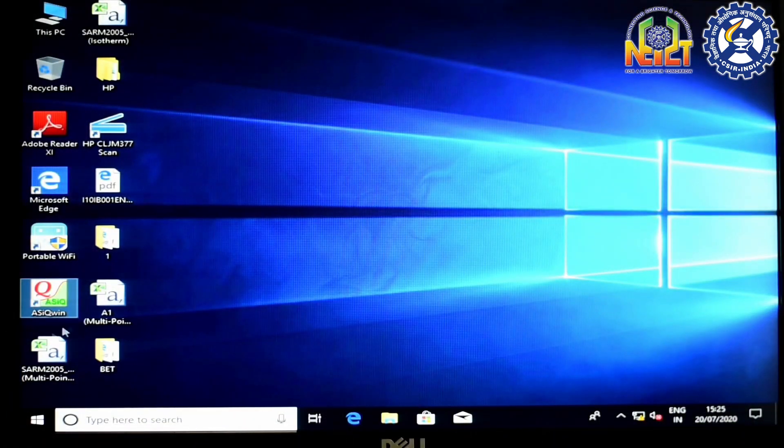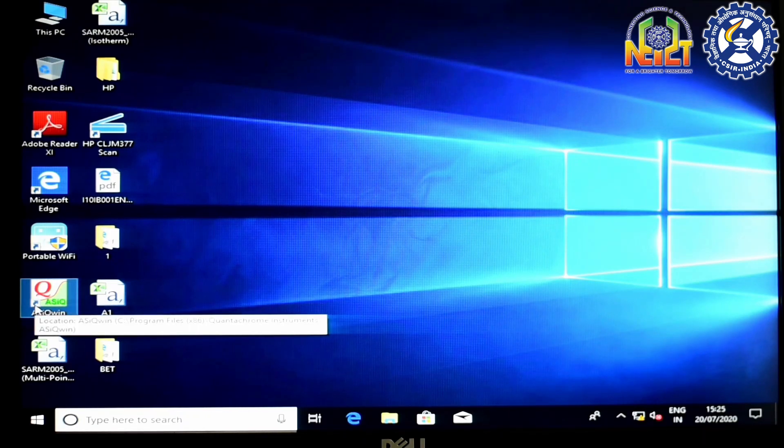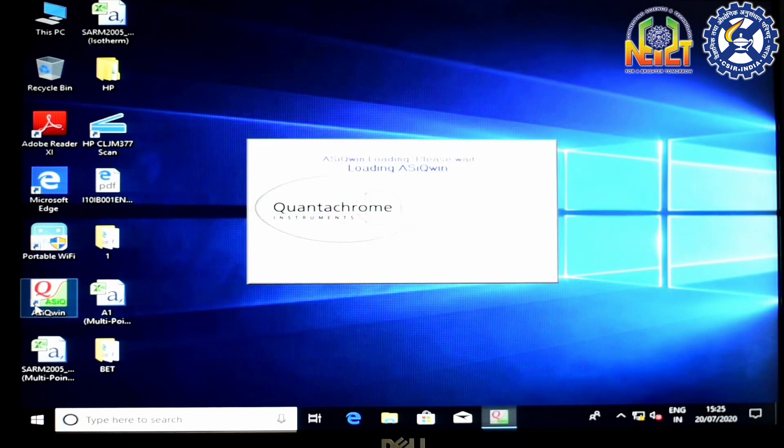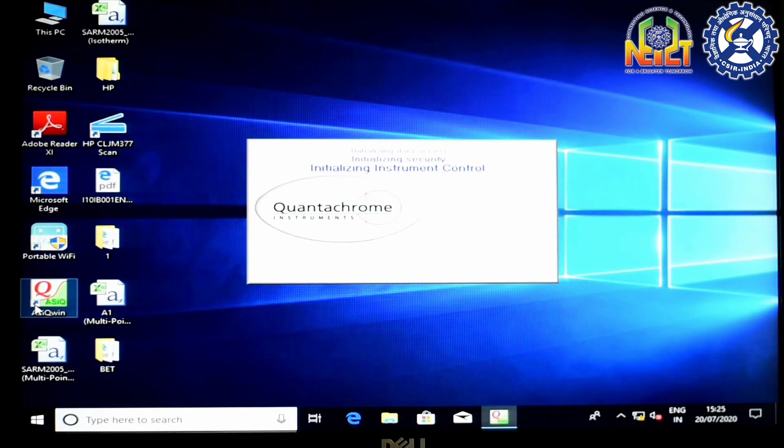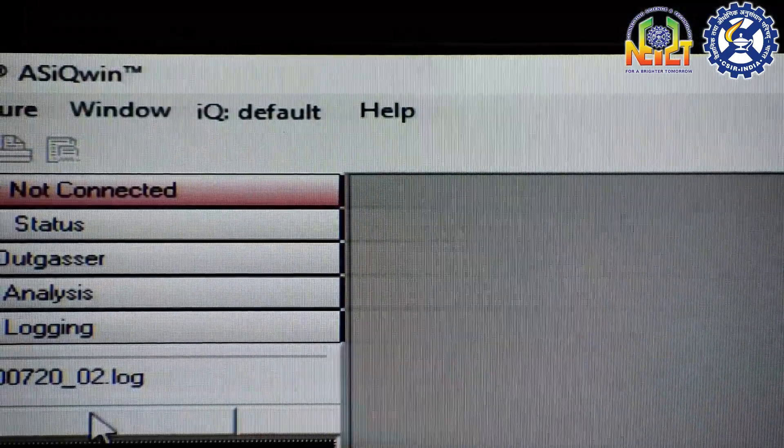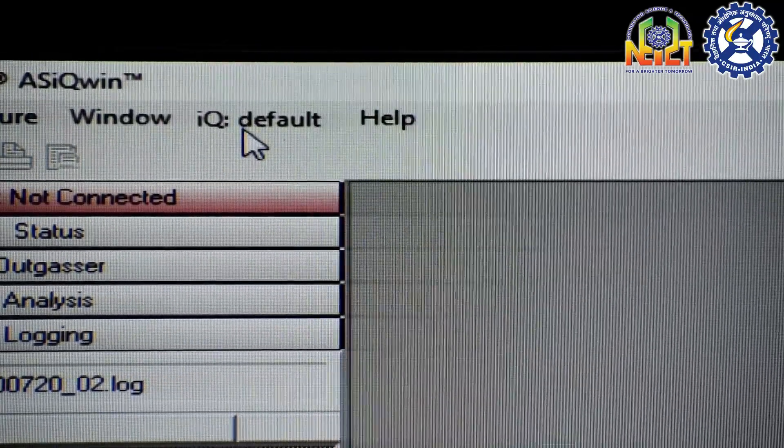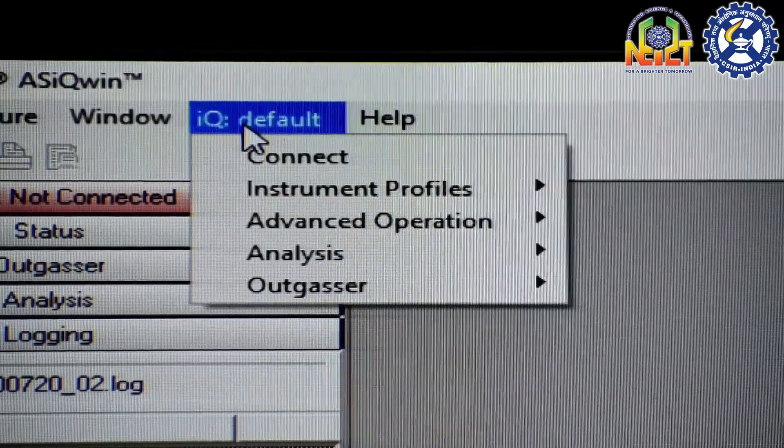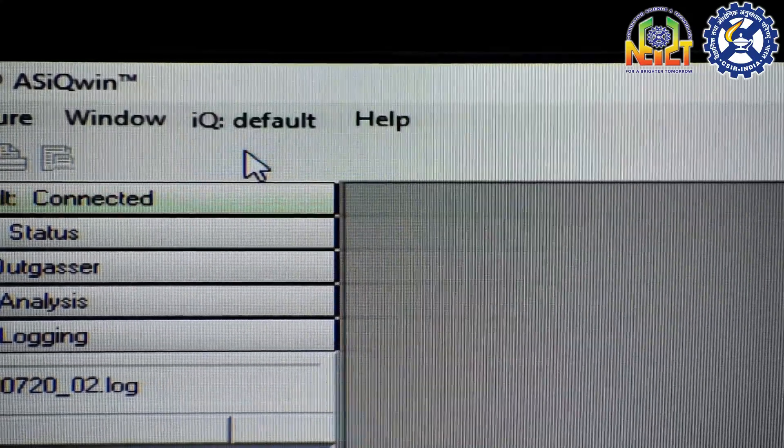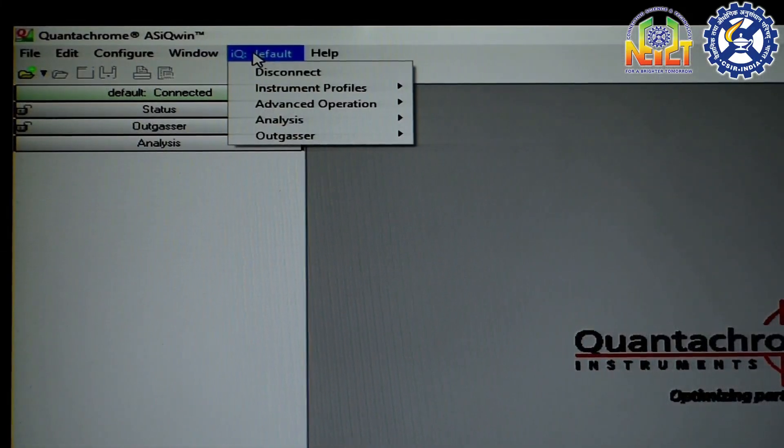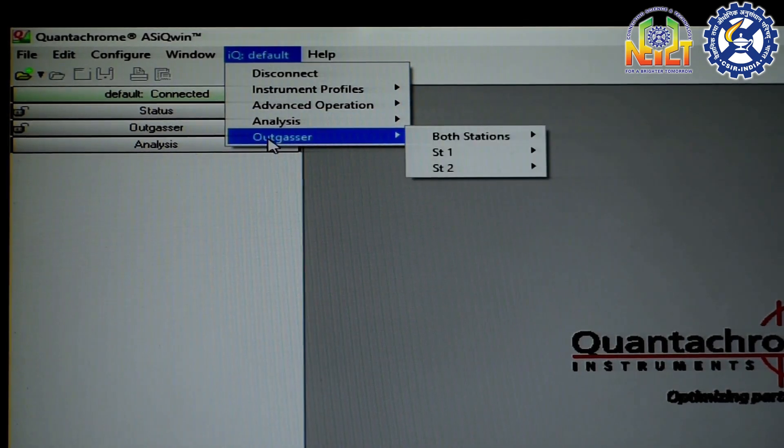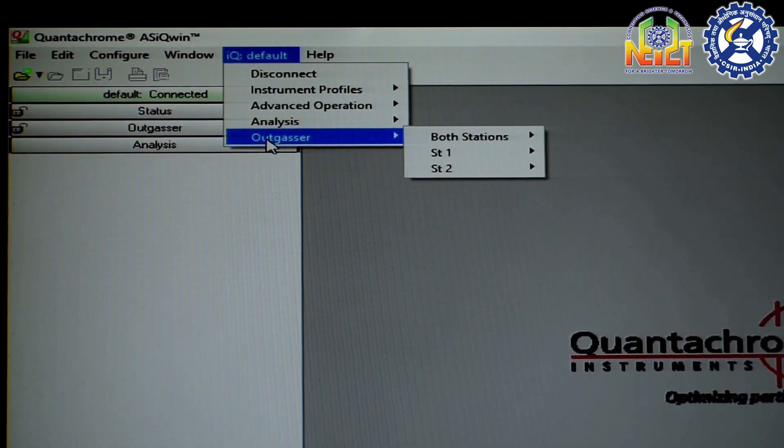This is the ASQ Win software which is used to measure the BET surface area of a given sample. In the software we have to click the IQ default tab and then click the connect option. In the IQ default tab we have to click the outgassing option for degassing and analysis option for measuring surface area.